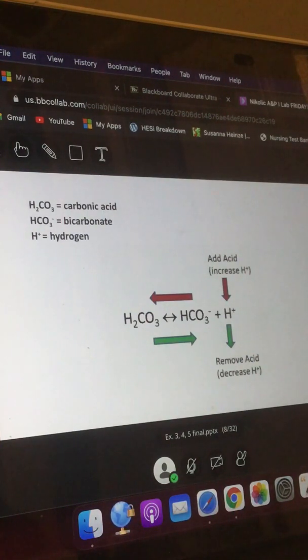But in this particular experiment, we are not actually looking at being outside of homeostasis. It's just that's how we apply this in the blood. All we're looking at is, hey, do I have a buffer or do I not have a buffer? And again, if you watch the video, no problem. If I want you to watch something in preparation for lab, I'll send you an email. So watching the videos, that's great. It's excellent, but we're going to go through each of the steps here.